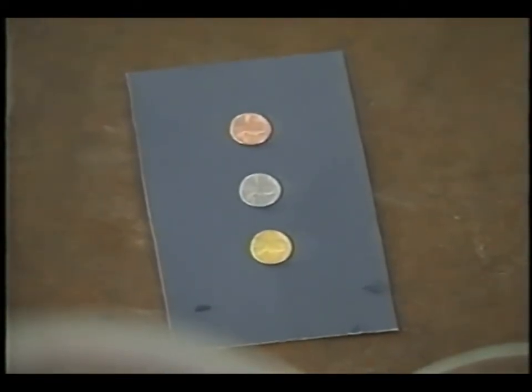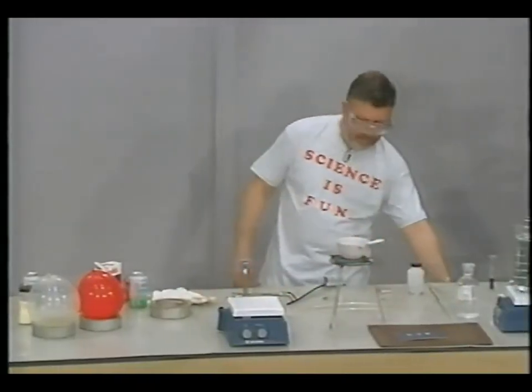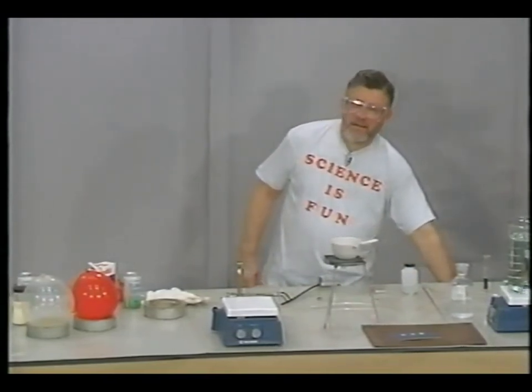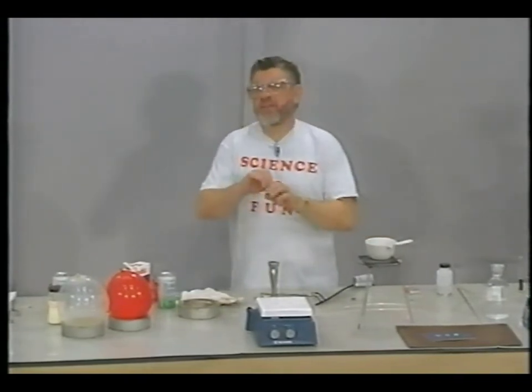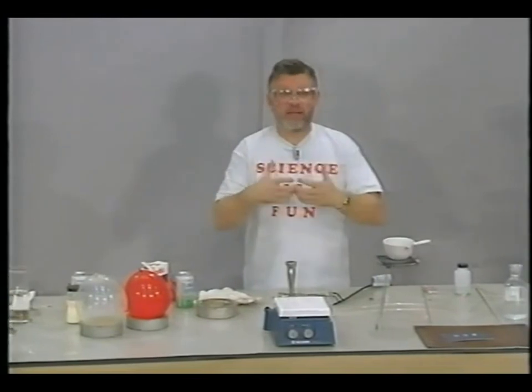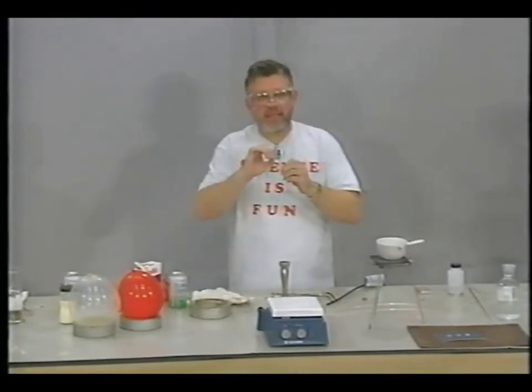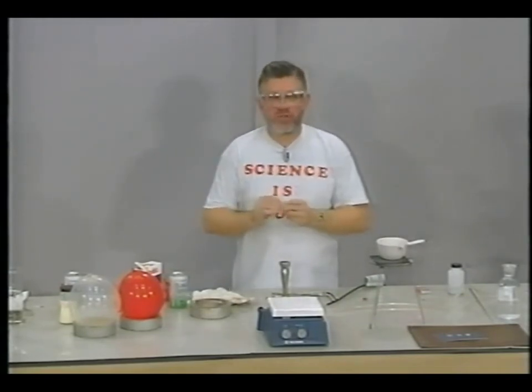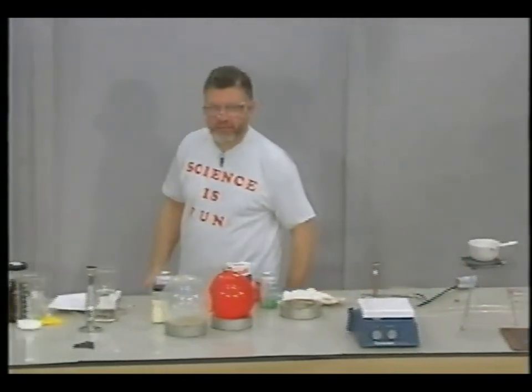So really what we've done is to deposit some zinc on the surface of the copper penny, give it that metallic zinc color, which looks like silver, and then when we heated the zinc that is coating the copper penny, the zinc diffused into the copper and formed an alloy. All right, so that's one experiment with metals.